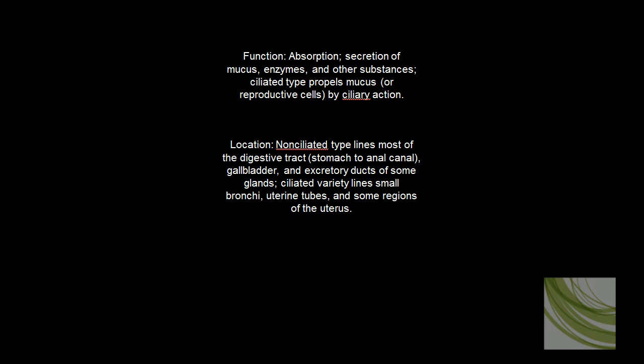We'll also find simple columnar that is ciliated in areas of the bronchi, the uterine tubes, and some parts of the uterus. In this area, they primarily propel, with the use of cilia, the mucus in a certain direction.